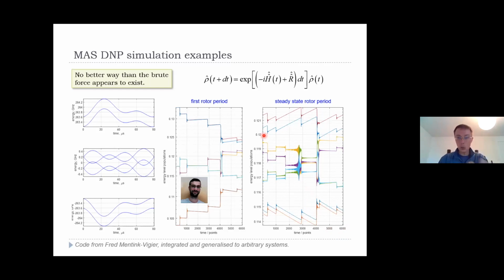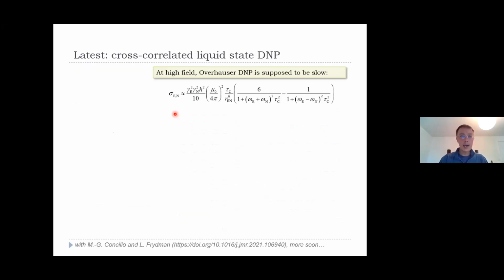All of this, so all of these pictures that I'm showing you, they are in the standard example set, which is supplied with SPINACH, all well documented. So I would say this efficient magic angle spinning DNP is at the moment about the brink of what the largest supercomputers can do if you try hard enough, chiefly because of such a grand averaging over so many different things. And finally, the last slide, and this is something that actually SPINACH enabled.